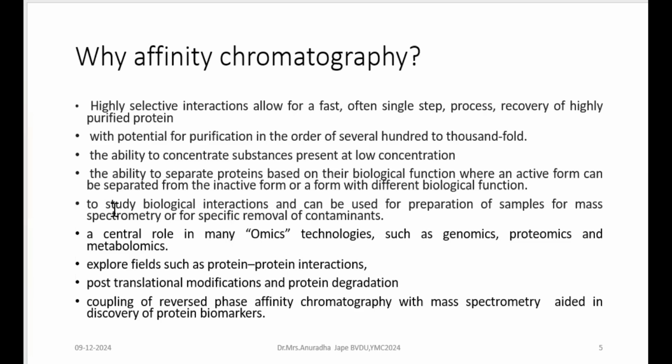So if you have a large volume, for example, an enzyme is produced extracellularly by a bacterial cell, and your fermentation is done, and you have to purify the protein of your interest. So initial cell separation and all these techniques you would do, but the total amount of enzyme in the initial phases of fermentation may be low, and you want to check whether the enzyme of your interest is present or not, but the volume is too high and the concentration is going to be too low.